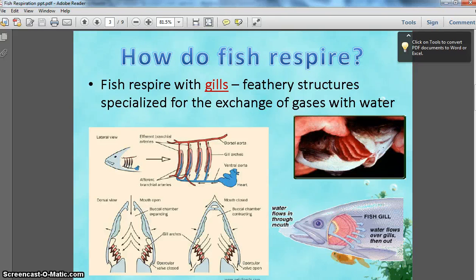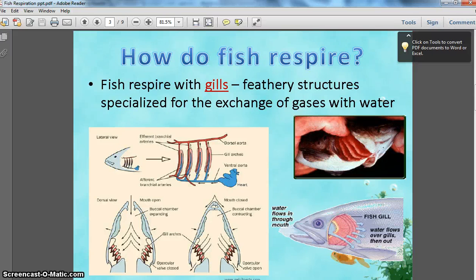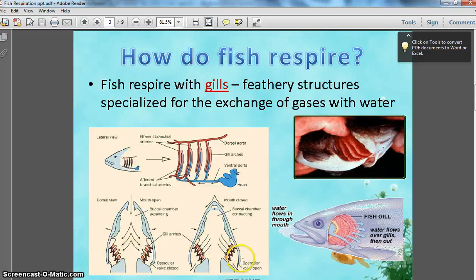The gills will get the oxygen by diffusion. Because of this, one of the ways we will be able to count the respiration rate of our goldfish is by watching the opening and closing of the mouth — one ventilation, or one part of its respiration rate. Another way you'll be able to watch the respiration rate of your goldfish is by watching the opening and closing of the operculum. The operculum is the bony arch that covers and protects the gills, and every time a fish has one ventilation, its operculum will open and close.